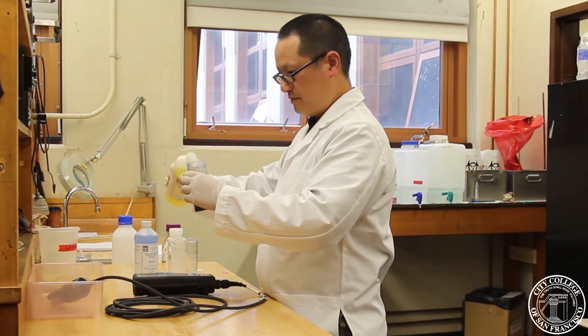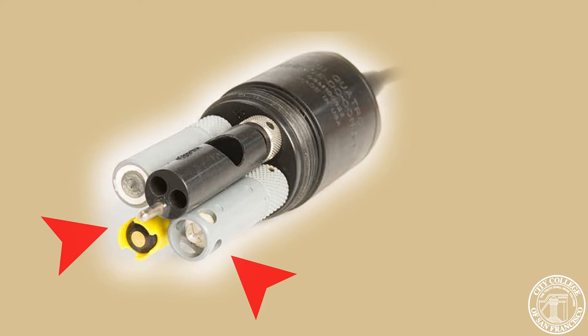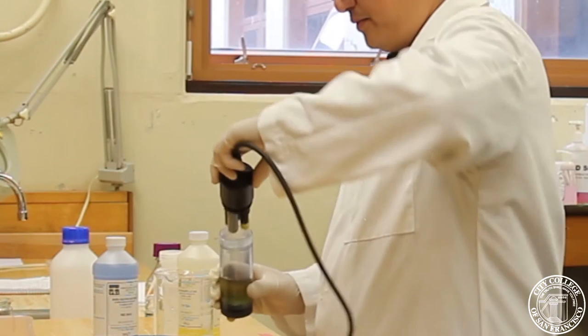Now, we want to fill the cup just enough so it covers the bulb of the pH meter, the bulb and the holes right over there. So, I'll set that down.